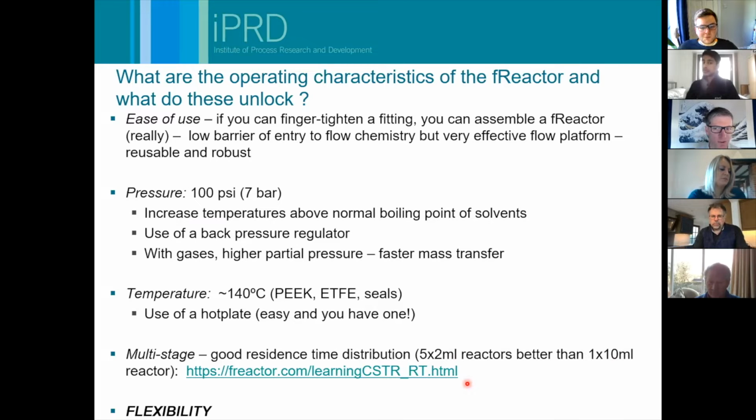And we find there's great flexibility within these reactors. I showed you how easy it is to add pipes in. Sometimes we feed into our first reactors only, sometimes we put other feeds in down the cascade, maybe to try and keep a particular reactant at high concentration. All of that's very flexible within our reactor system.